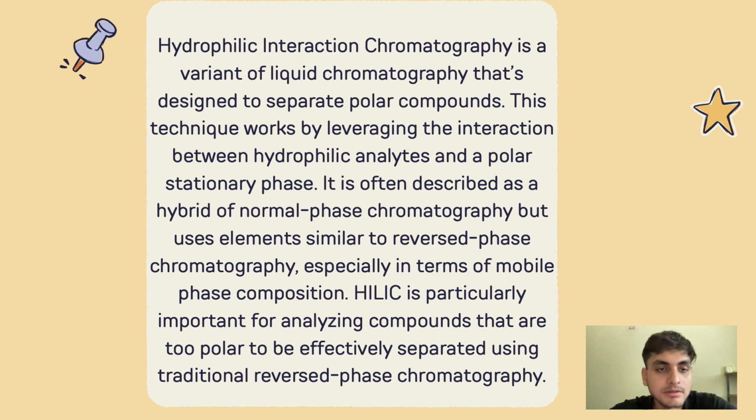here we will see hydrophilic interaction chromatography is a variant of liquid chromatography. It is actually liquid chromatography with some advanced phenomena going on, designed to separate polar compounds. This technique works by leveraging the interaction between hydrophilic analytes and a polar stationary phase.